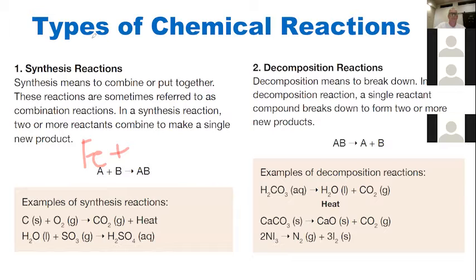Would it be salt? Mm, nope. Something you don't even... Oxygen? That's right. I was going to say it's something you don't even need to add because it's already in the room. So yeah, oxygen is the other reactant. And you're going to be making iron oxide, or rust.